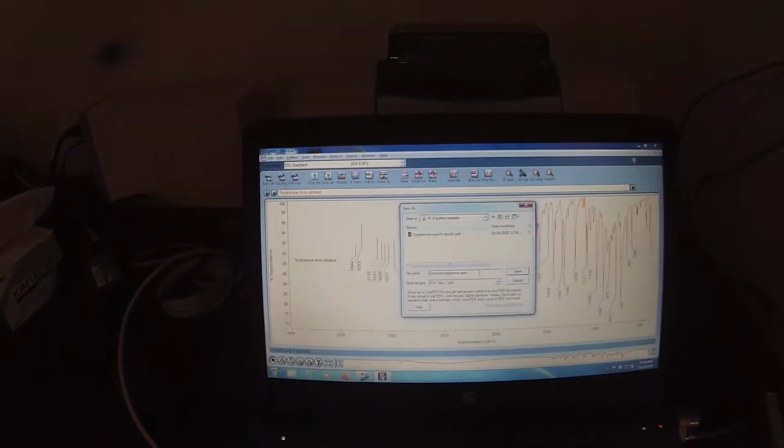Oh, come on. Behave. There we go. And now I want to do that IR spectral interpretation to see if we can identify functional groups. And it thinks it's a para-substituted aromatic hydrocarbon. It really isn't, and unfortunately it's not identifying it as an amine, which it should. So we're going to go ahead and print that. It's actually more of an ortho-substituted aromatic hydrocarbon, but it is two fused rings.